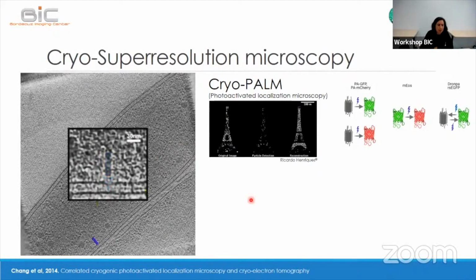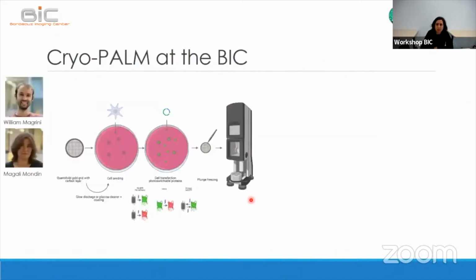So the point is that many people here in Bordeaux are interested in this approach because they want to localize their protein of interest very precisely and to do single particle analysis. We have a big community of people that do single particle analysis in Bordeaux now.